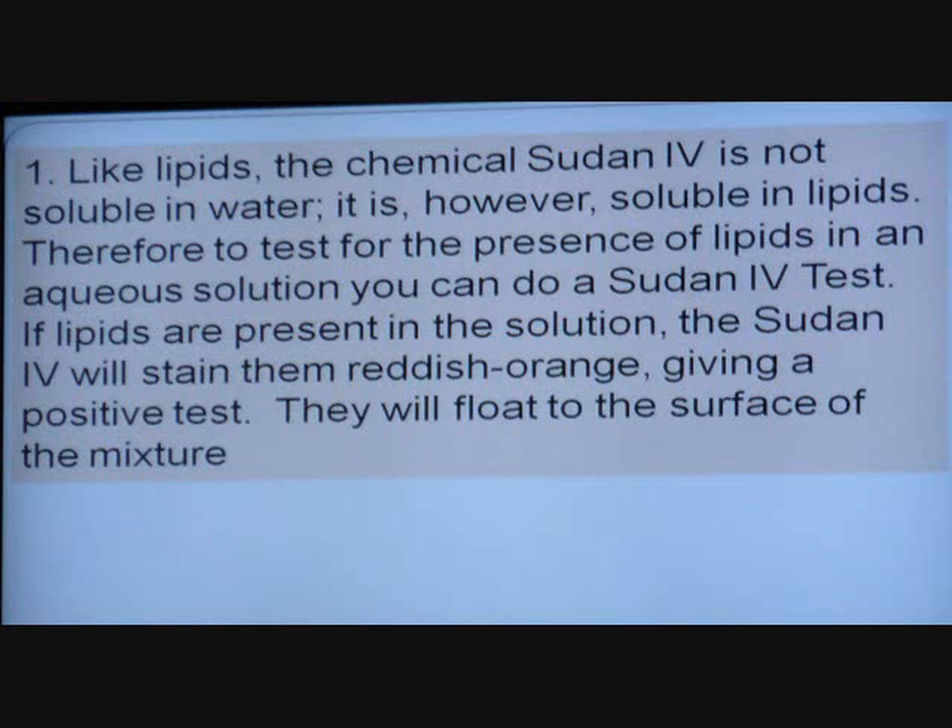If all you see is like a wet spot but no light coming through — it's not translucent — it's not fat. That's a very high cap test though. You can also use coffee filter paper. So I want to see how Sudan works.